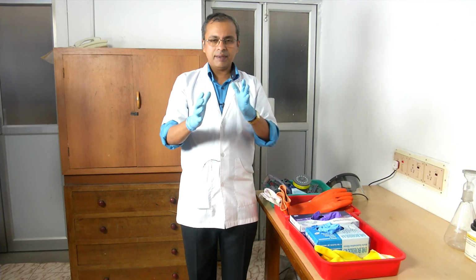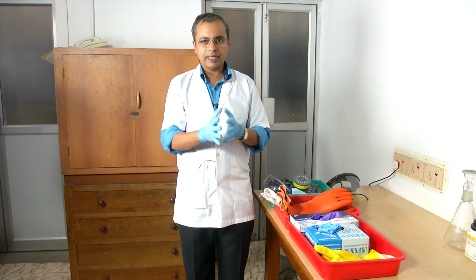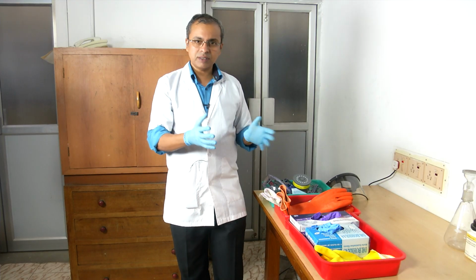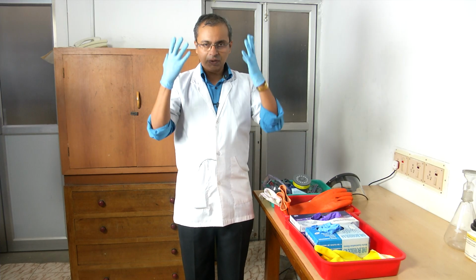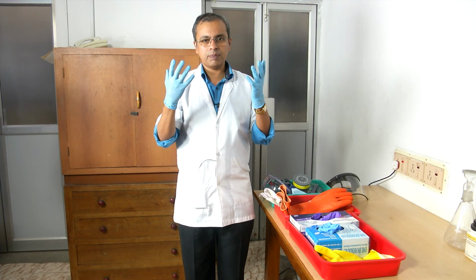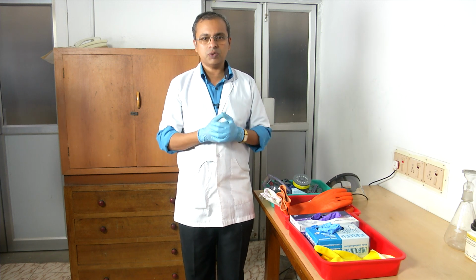So, as I have just shown you, there are a set of gloves which provide safety for your hands, and then there are masks which provide safety for your nose, for your breathing process, and there are a set of shields and goggles which provide protection for your eyes, in addition to the uniform that you wear, which provides you with general protection.